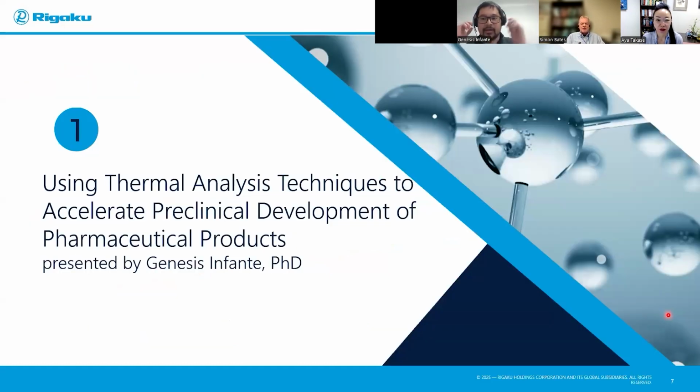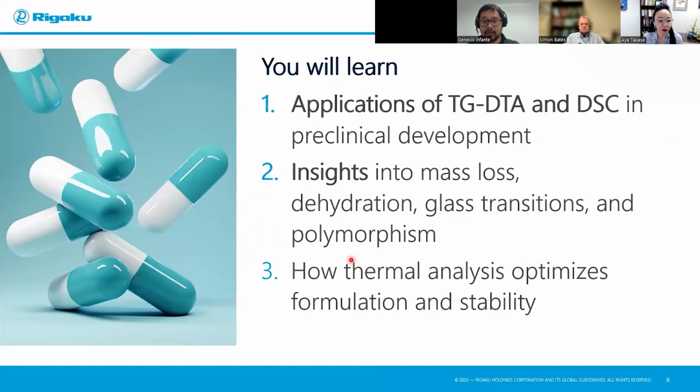All right, everybody. Hello. Thank you for the introduction. So I'll be covering the presentation about using thermal analysis techniques to accelerate preclinical development of pharmaceutical products. My goal today is that everyone that participates will gain some insights and lessons about the applications of TG-DTA and DSC techniques for preclinical development, and insights about the mass loss, dehydration, glass transitions, polymorphisms, how thermal analysis optimizes formulations, and hopefully your clinical or study stability.